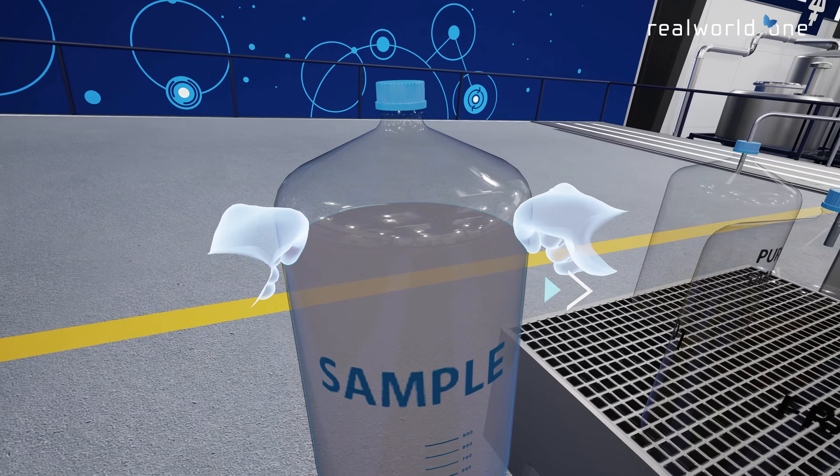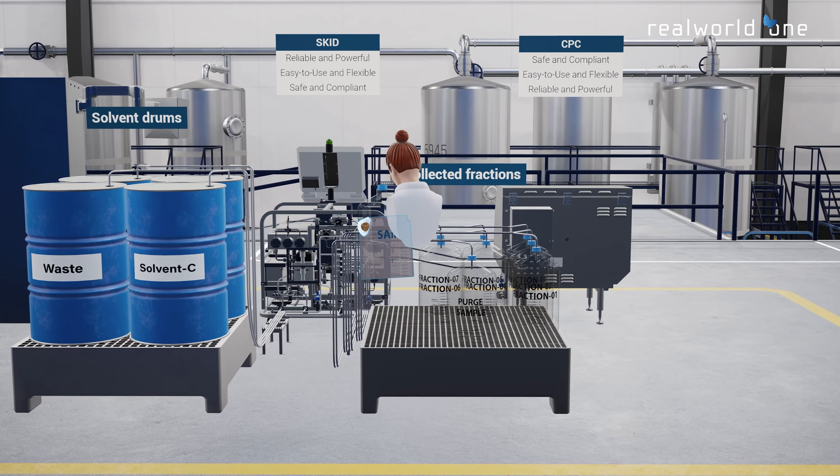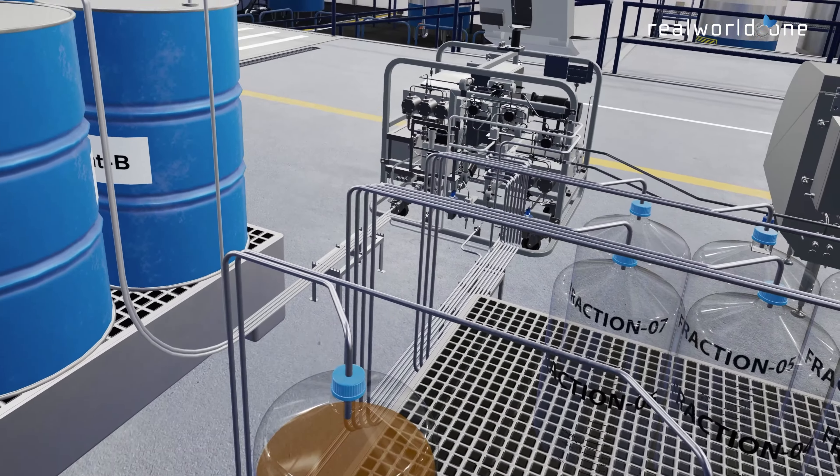Gilson's Verity CPC Process System recovers molecules of interest at a purity higher than 90%. Let's have a quick look at the process of purifying molecules from complex samples, such as plant extracts.